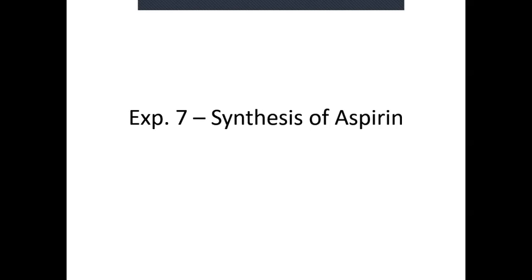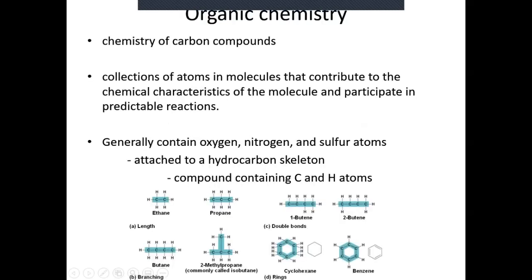The reason that students do the synthesis of aspirin lab is this incorporates an area of chemistry called organic chemistry. In organic chemistry, what we're doing is we're changing certain groups on the molecules to make new molecules with different chemical and physical properties.